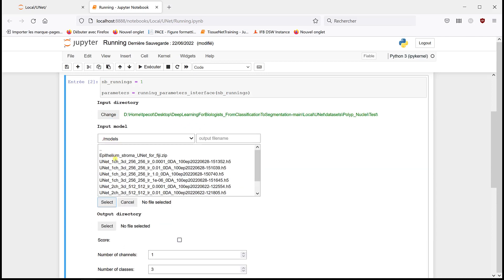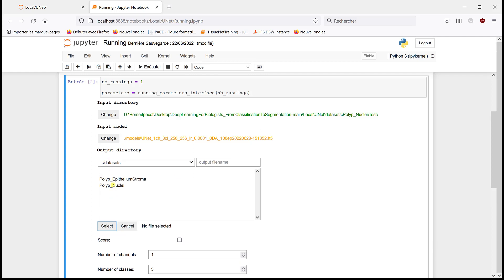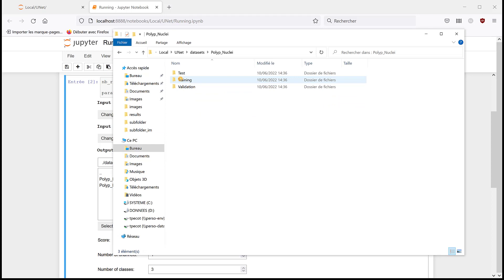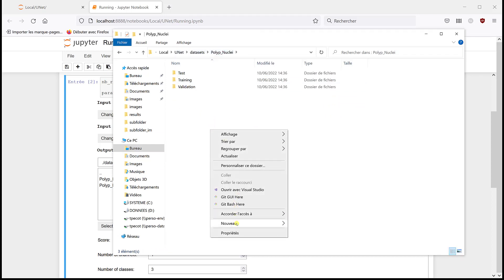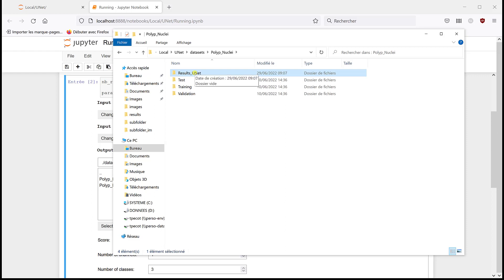Then I'm going to select the model that gave a good result. We saw that e-2, e-4 were very similar to e-4. And in output directory, I don't have any output, so I'm going to create one. I'm going to go back to my folder here, in datasets, polyp nuclei, and test I have the images. So here, I'm going to create results in the unit, and it's going to be scores.